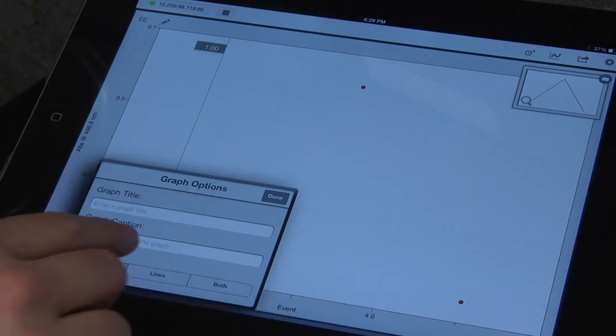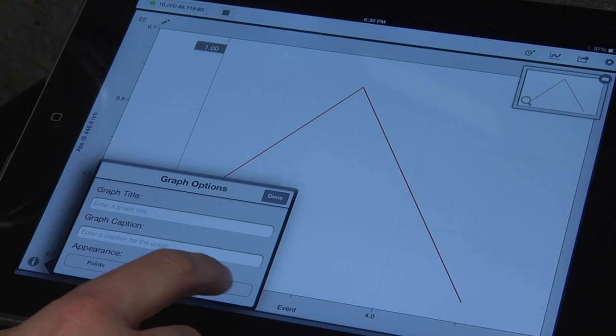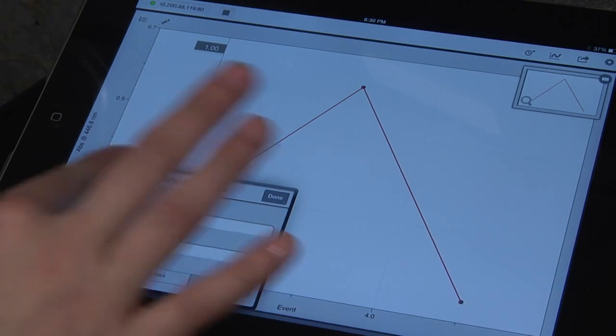It'll say graph options and you just click lines or points or both. This is also where you can make a title for your graph and label your axes.